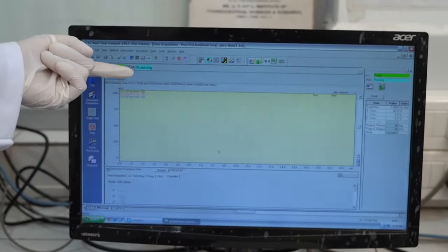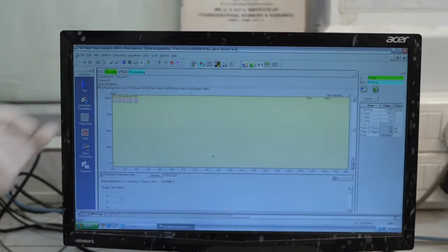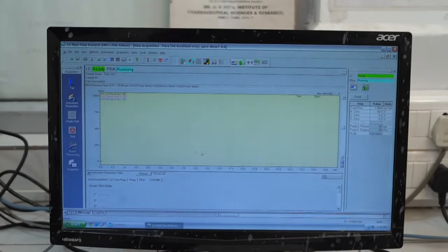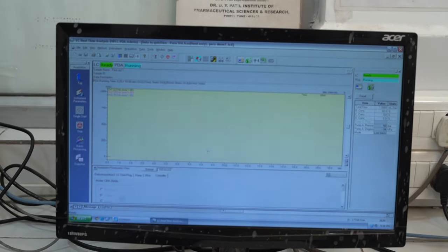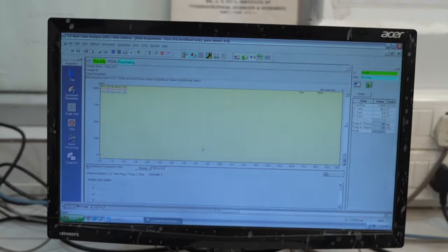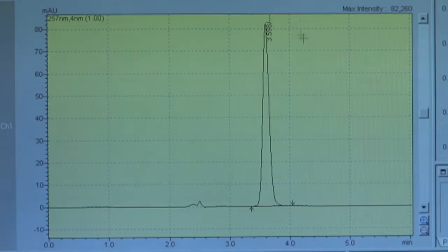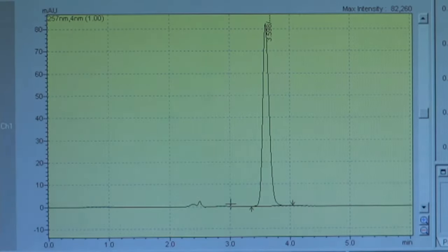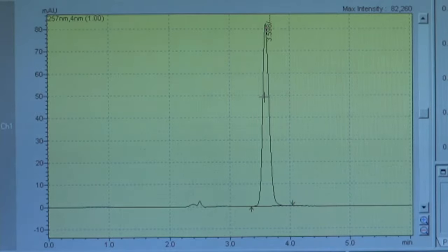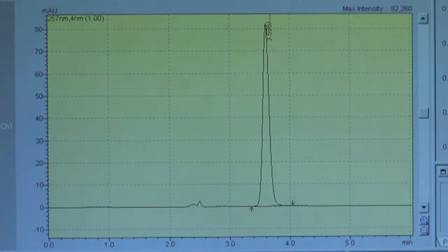Once the sample is injected, we will turn the knob from the load to inject position and the analysis will start. Here we can see the single start analysis has been initiated and this is the chromatogram obtained for the sample injection. In the same way, we can do this for all other standards and samples. Once all injections are done, we can analyze our data in post-run analysis.